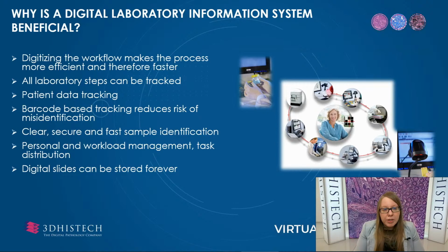Why is a digital laboratory information system beneficial? The laboratory information system is a sample tracking system, which makes it possible to keep a continuous record of the laboratory workflow and to check the stages of the sample processing at any given time. From the moment the sample arrives at the pathology laboratory, all sample-related data is registered and every workflow step is traceable with barcodes. This helps to reduce mix-ups of pathological samples, paraffin blocks or sections.